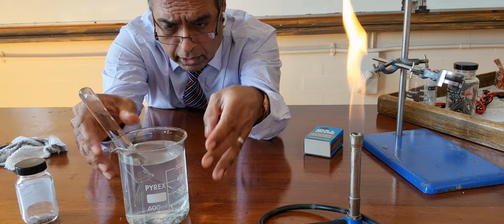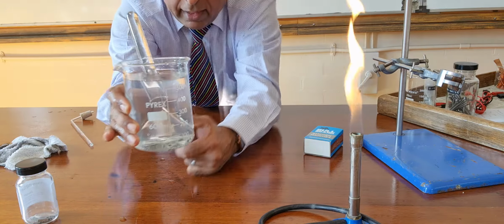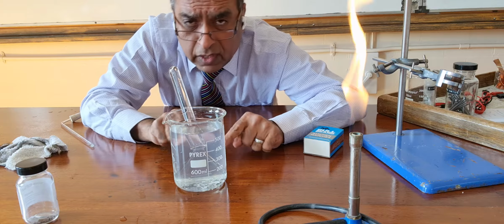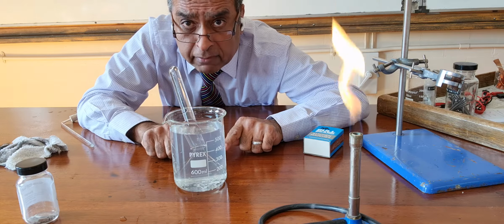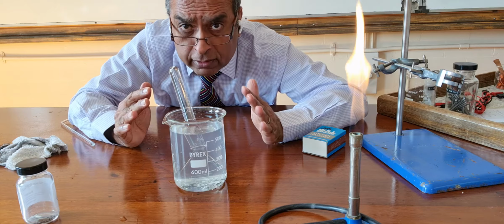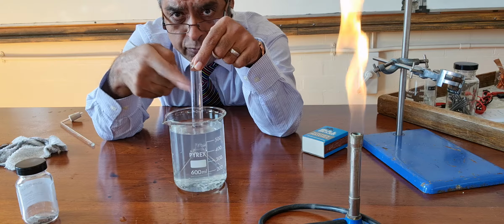Now, I want to leave that for about a week. What I want to see is the bubbles. You can perhaps see the odd bubble forming now on the magnesium. But over a period of about a week, any bubbles given off will be funneled up the short spout that's broken on the funnel and into my test tube of water.